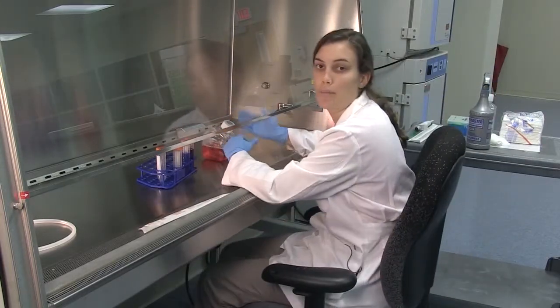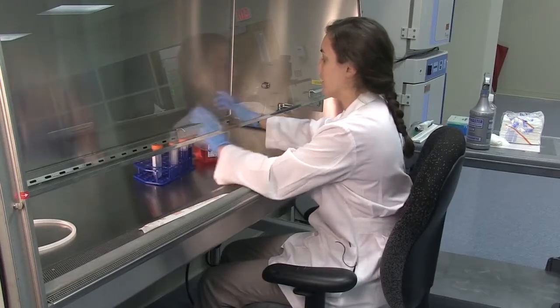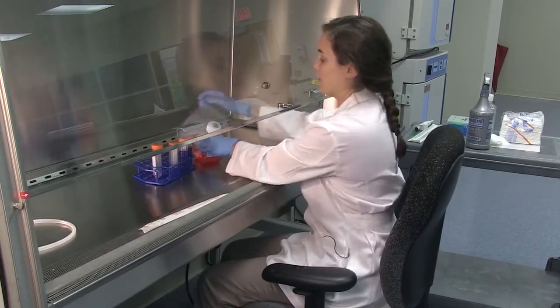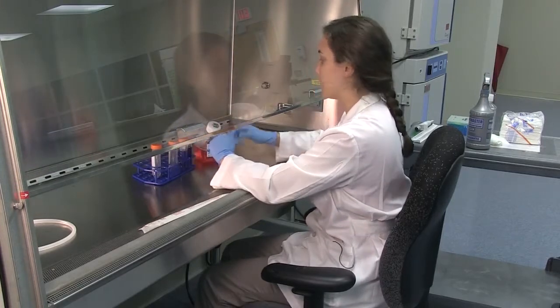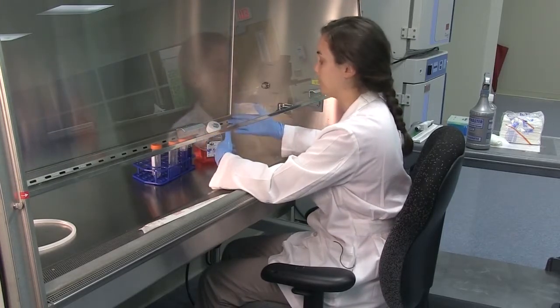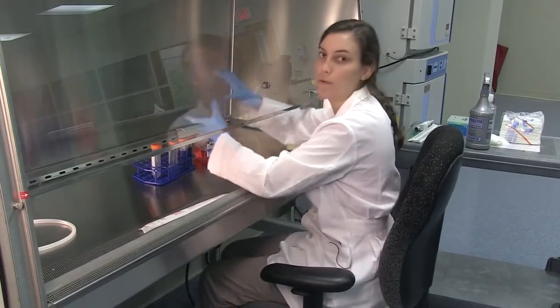I'm going to demonstrate how to properly transport media while keeping it sterile. It's important to loosen all the lids of the media bottles or tubes you're working with — this will prevent you from touching things that shouldn't be touched when trying to force open a bottle.